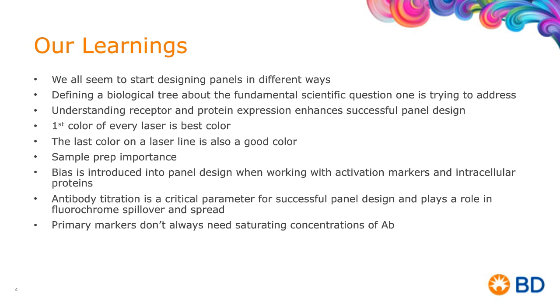It tells us what we're looking at, and it defines what types of colors we might want to use. And it also shows us, when we build these, that once the tree branches separate, something we do to one side is not going to impact the other, because the colors don't jump across from one cell to another.